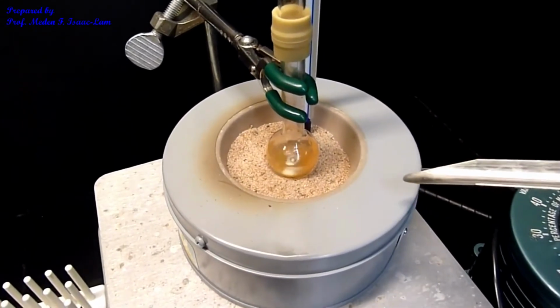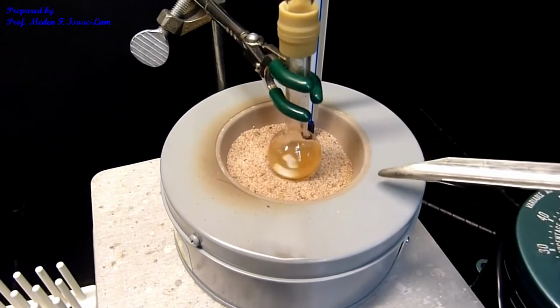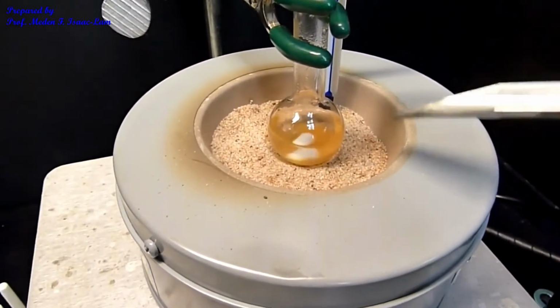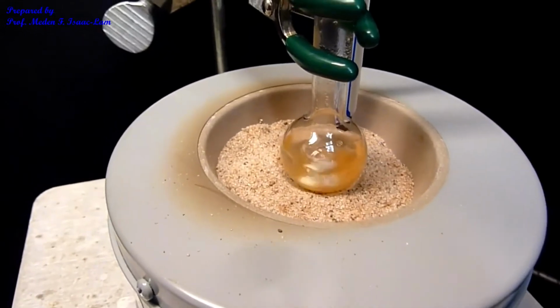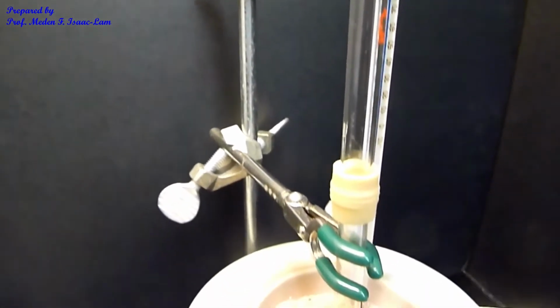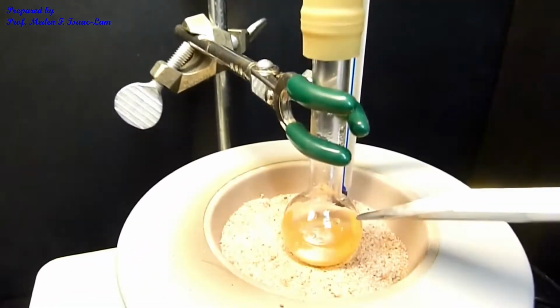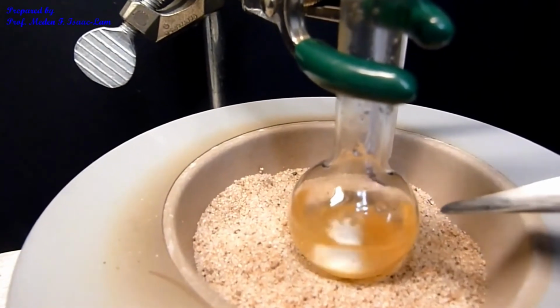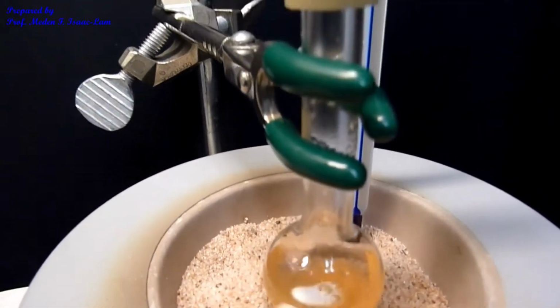So right now, I've been boiling it for about 10 minutes, and you can see the big bubbles. It's popping a little bit, but it's okay. The vapor is not going up the air condenser. It's way down here. So you can see the reflux of the vapor coming up and then going down. And the temperature right now is about 146.